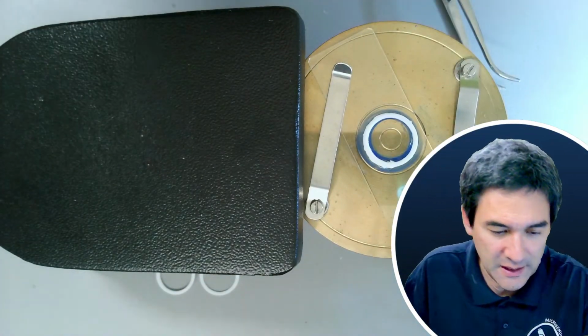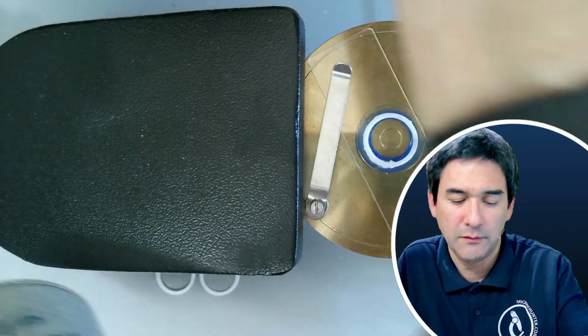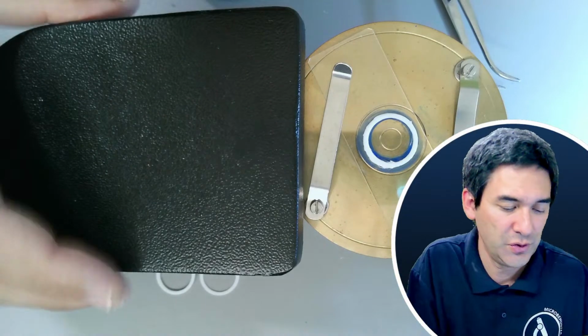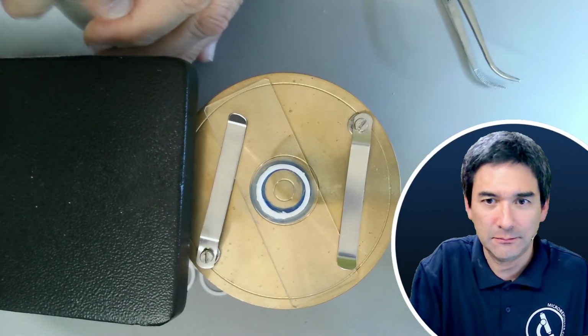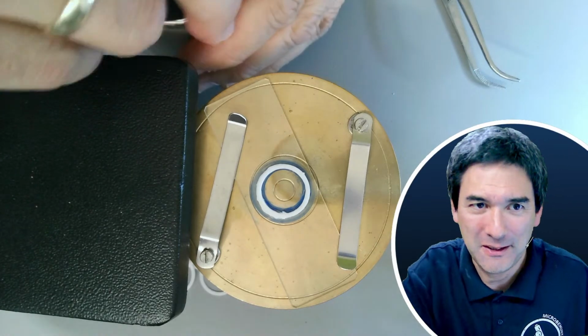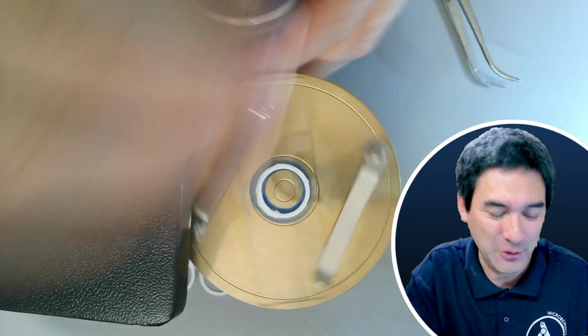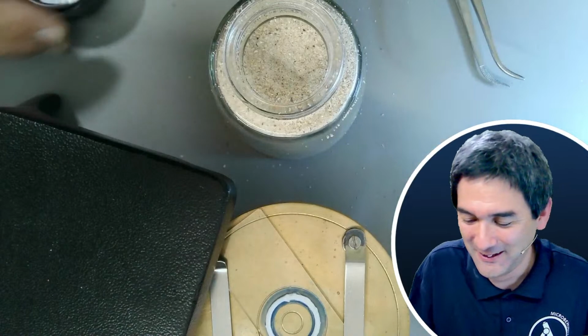Let's try a different sand. The one from Cape Town. How is that? Cape Town, from the year 2000. It's Cape Town, South Africa. Oh, hear that? Horrible sound. Sand grains scratching.